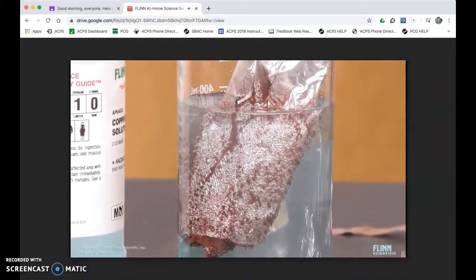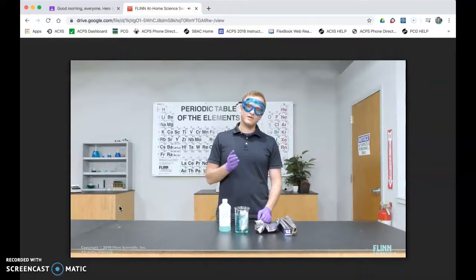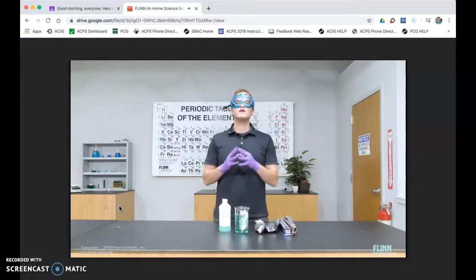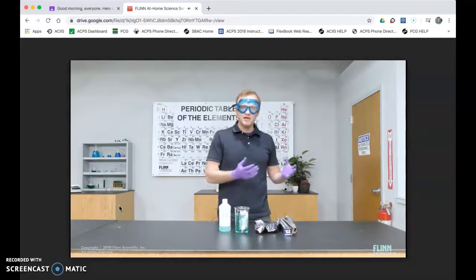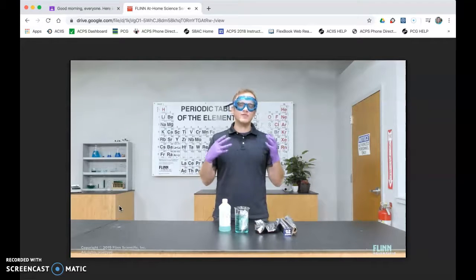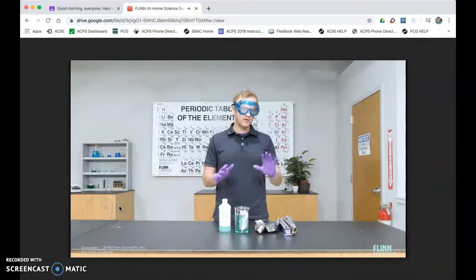Now, if, theoretically, you expose aluminum to something that had this kind of reaction with it and it degraded, that would be a bad thing if we constructed our bus of aluminum. So in this lab, what you're looking for is a really inert metal, something that stands up to the elements, something that if you take it outside, it really doesn't have a lot of reactivity. It's stable as is, and therefore a great material for construction, particularly of a bus.